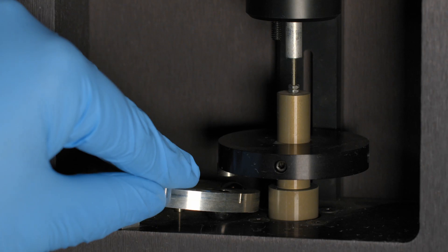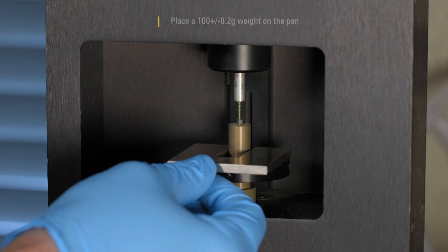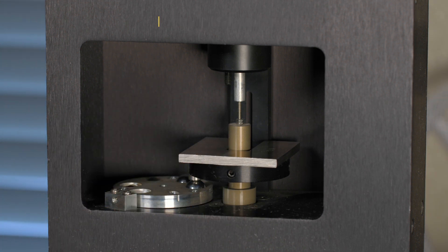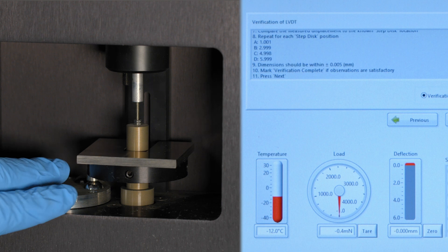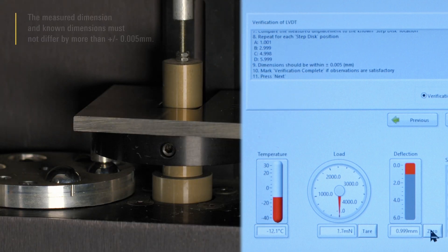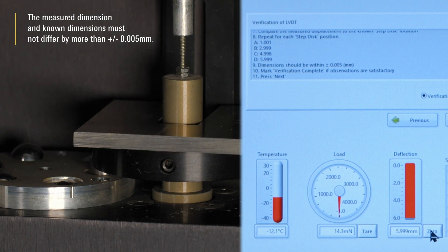Verify the displacement transducer. Place the stepped gauge block under the weight pan. Place a 100 plus or minus 0.2 gram weight on the pan. Rotate the step gauge and compare each measured step with a known dimension. The measured dimension and known dimensions must not differ by more than plus or minus 0.005 mm.